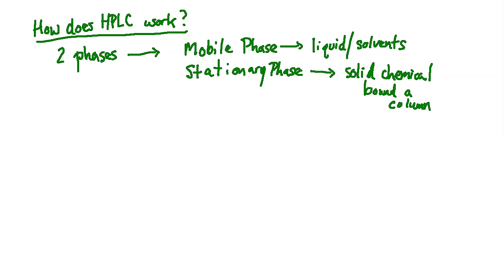And you really have sort of a give and take between the mobile phase and the stationary phase. So when you're doing this, you will take your sample, it will be loaded with the auto injector into the column along with some mobile phase, and then your sample will adhere to the stationary phase. It's almost like glue or some sort of a sticky pad.